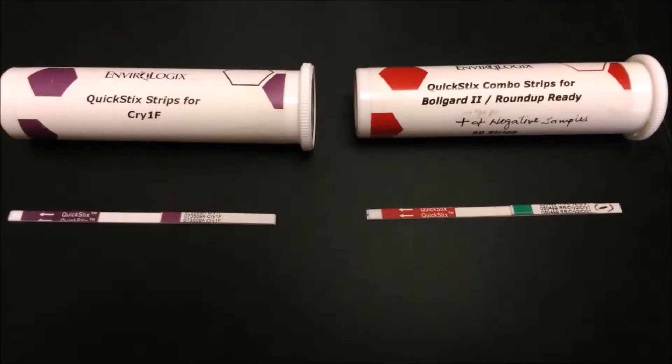The strips are selected according to specific proteins like CRY1F, BOLLGARD2 or Roundup Ready. For this demonstration, a strip for the detection of CRY1F protein will be used.